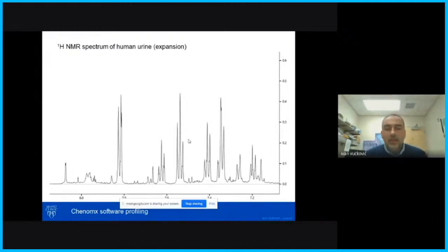You can also integrate the HMDB NMR database and use those compounds. Then you can use peak fitting to get concentrations of metabolites that you can identify in the spectrum. You can just type a specific component, and it will try to fit its spectrum into the experimental spectrum of the sample that you have recorded. Or you can just click over a specific peak and search all the components that might have peaks around that area, and then you try to fit them.